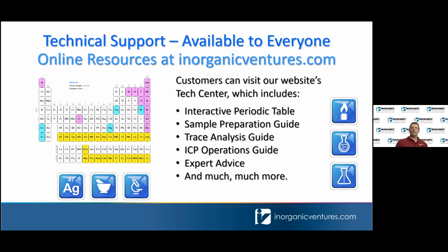Okay, great, thank you. A couple of questions now about tubing. So this one is regarding ismaprene tubing, or ismaprene, maybe the correct pronunciation, I'm not really sure. So this is essentially a pharmaceutical medical grade tubing. My experience is it's the brown, opaque peristaltic pump tubing, and it's a polypropylene based elastomer. So I know that we have not really used that much here in the lab, guys, but do you have any ideas about using pump tubing that is not your typical clear plastic, or might be used in more of a pharmaceutical or food grade application?